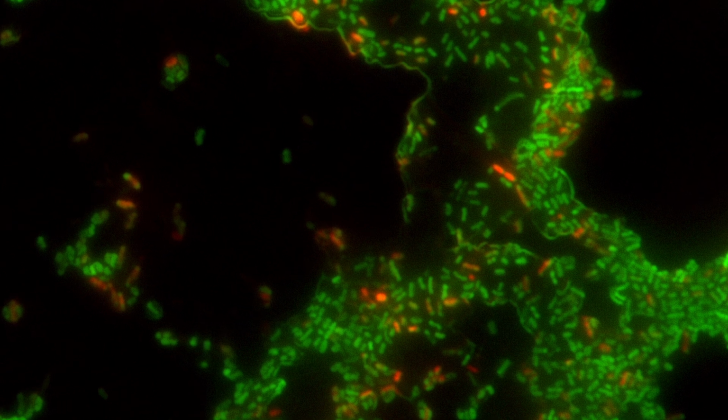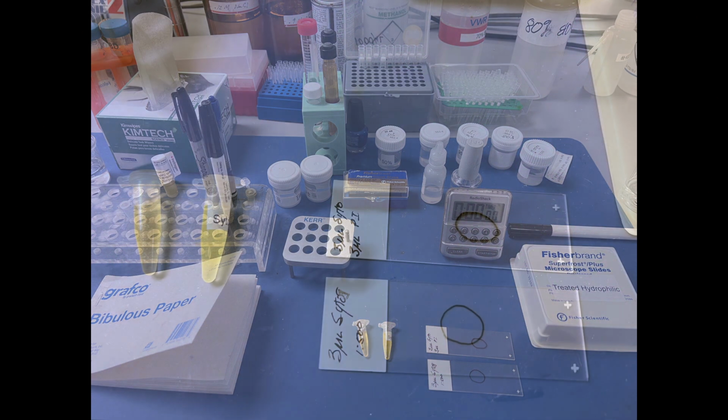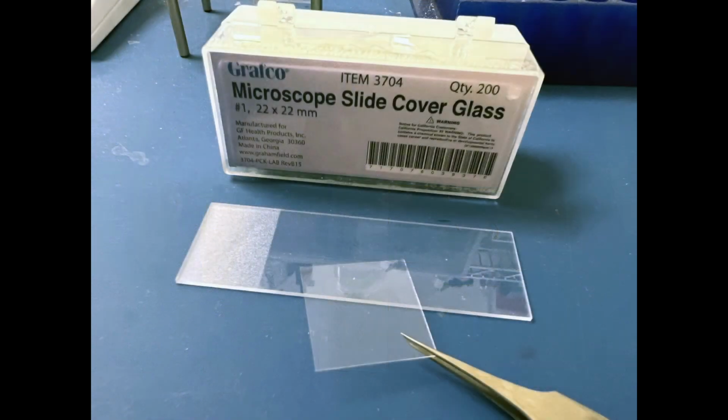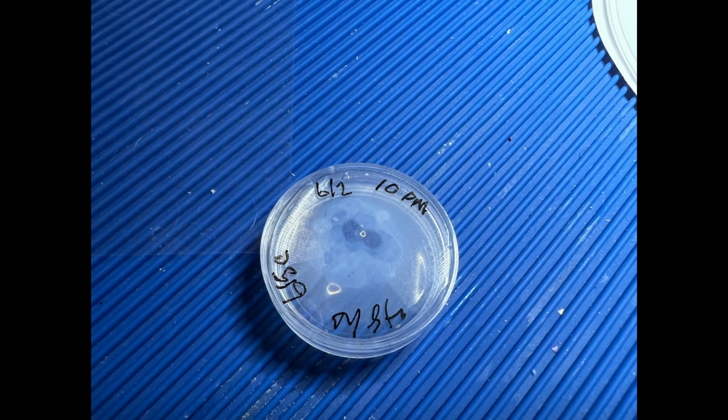The way I've been doing this previously was that you take your culture and you spread it out on a glass slide, and then you apply the live dead while it's still in culture, and then you put a cover glass over the glass slide, and then put the glass slide in the fluorescent microscope. But it doesn't really allow you to examine cultures at different time points. Once they're put on the slide, you've pretty much ended the experiment. So the culture dish gives you a lot more flexibility.